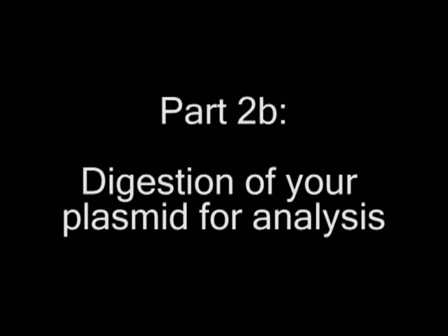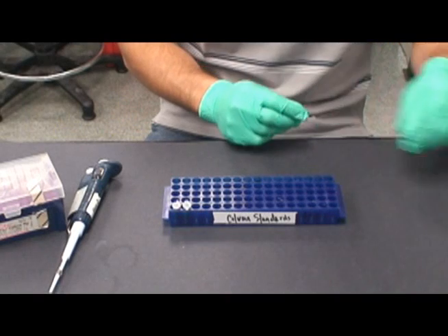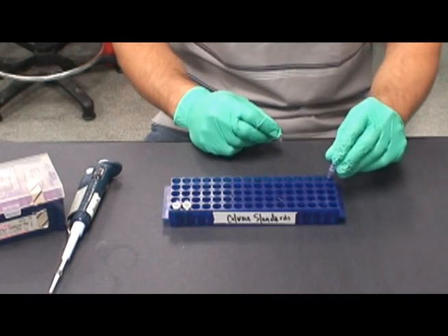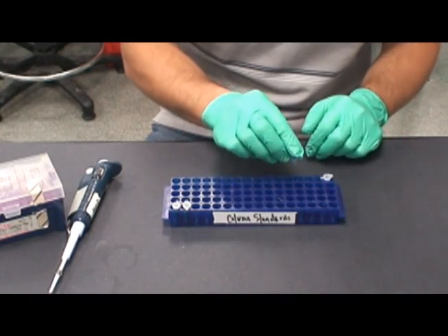Now it is time to digest your plasmid for analysis. We have labeled two 0.5 milliliter microfuge tubes. The first one, PUC19 and Hindi 3, the other one, PUC19 undigested.